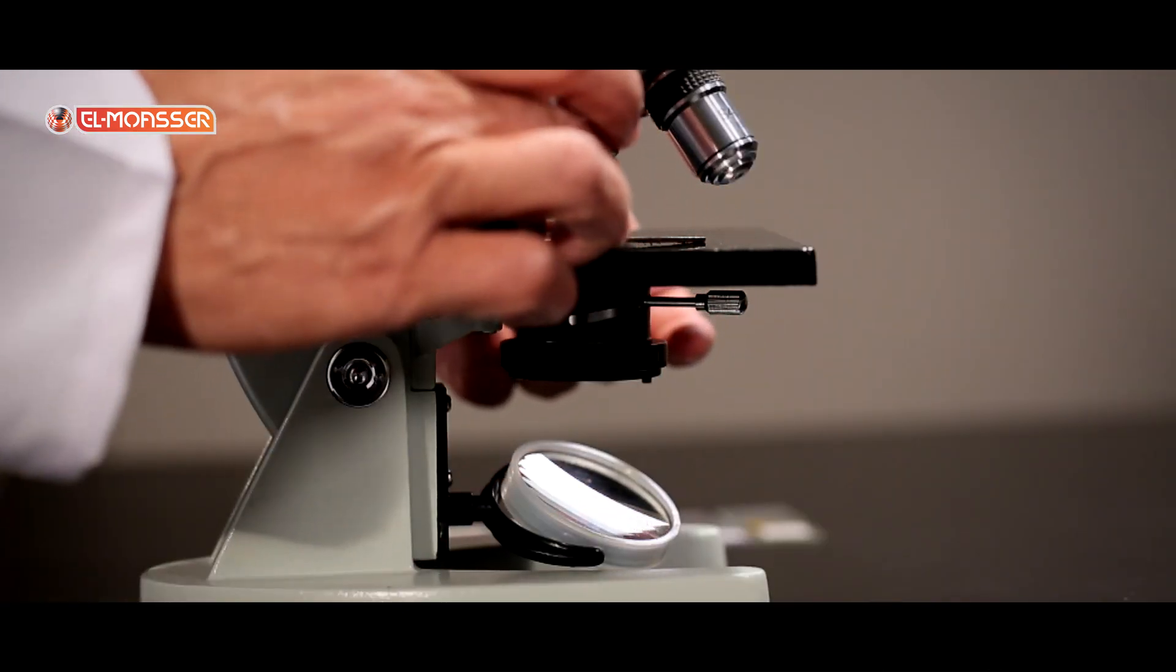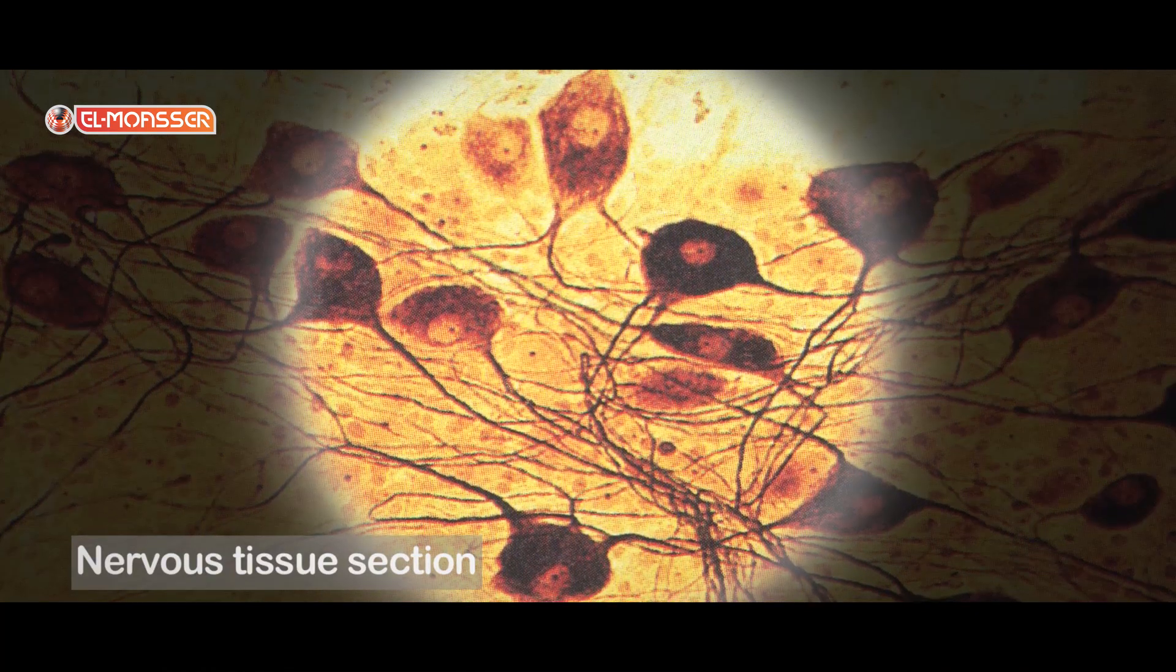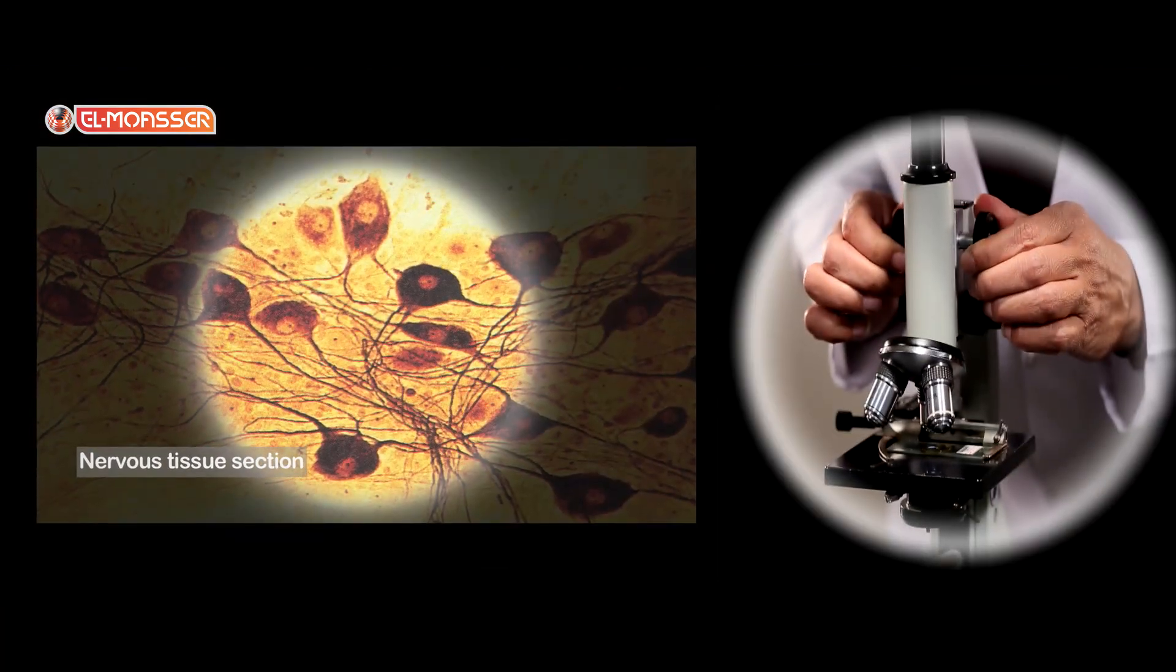Place the sixth slide on the stage. It is a nervous tissue section. The nervous tissue consists of branched nerve cells.